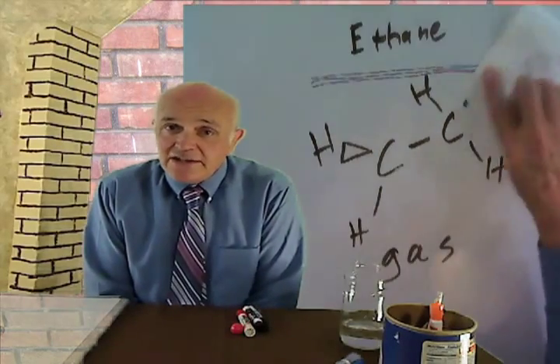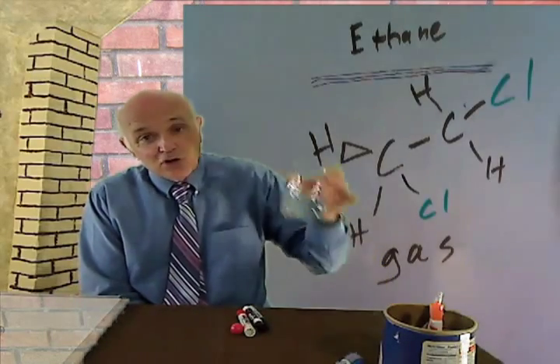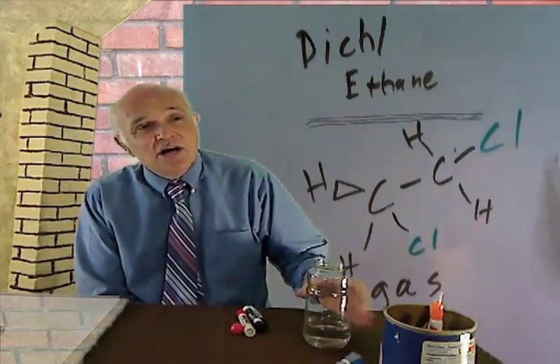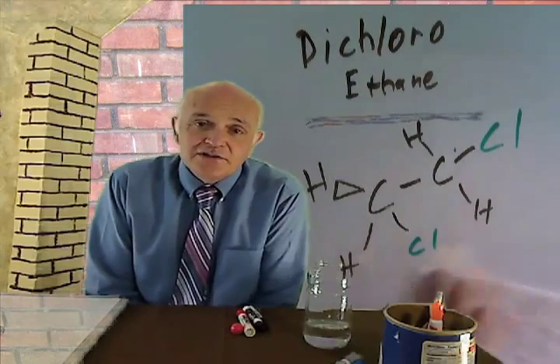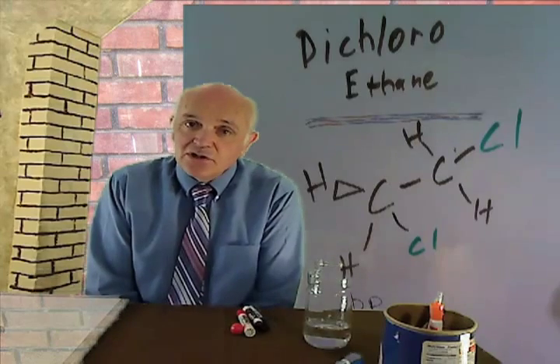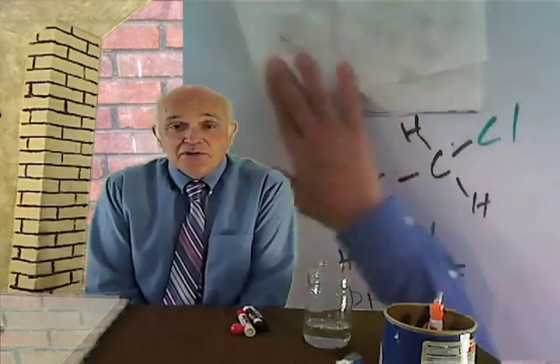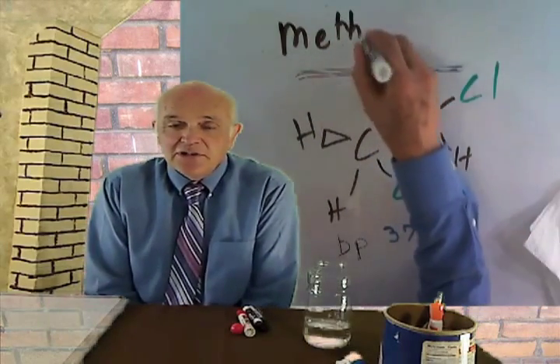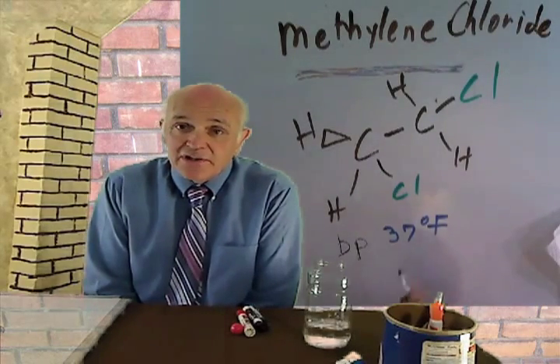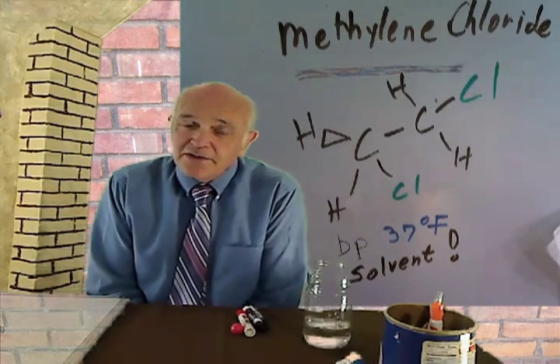So the first stage of the 8270 results in a rather large container of methylene chloride, like 100 to 200, even 300 milliliters of methylene chloride, with very small amounts of whatever it is you're looking for. So the first step is, what are we going to do with all this methylene chloride? It's like 99.9999% methylene chloride, and what you're looking for is kind of buried in all that methylene chloride.